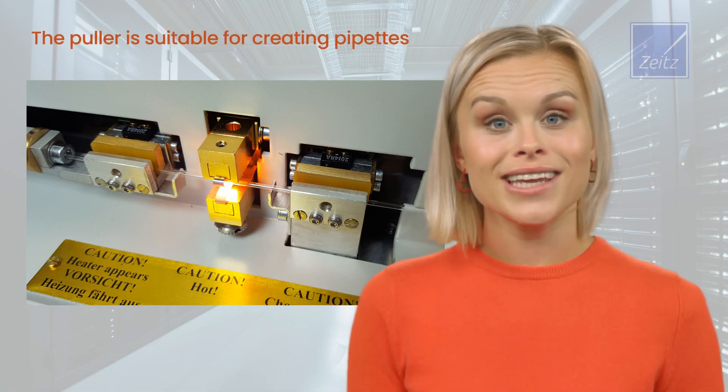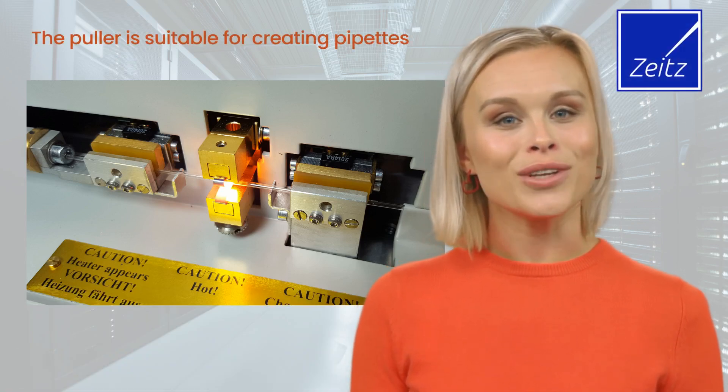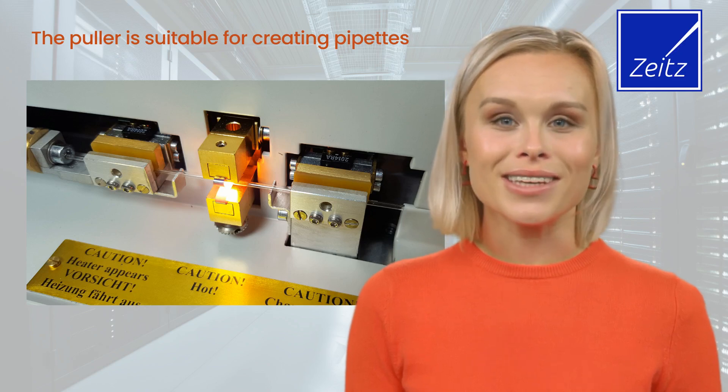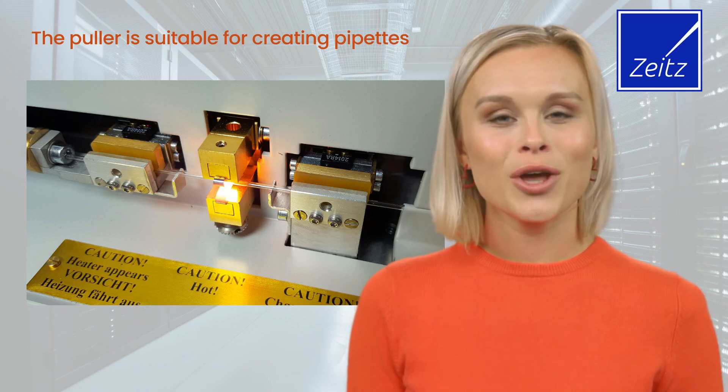The puller is suitable for creating injection and suction pipettes with a tip diameter smaller than 0.2 micrometers. It also features fast heater retraction, eliminating the need for air jet cooling, enhancing efficiency.